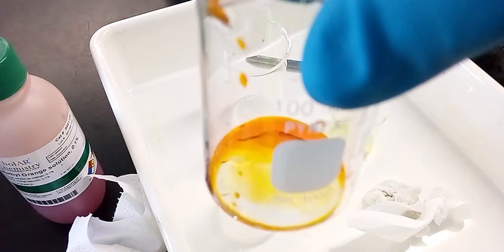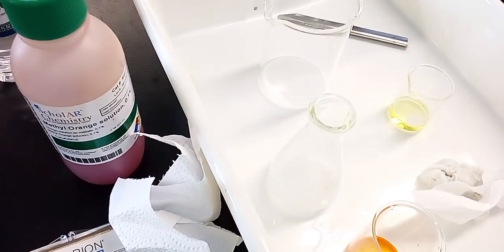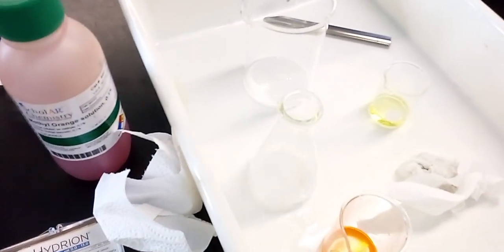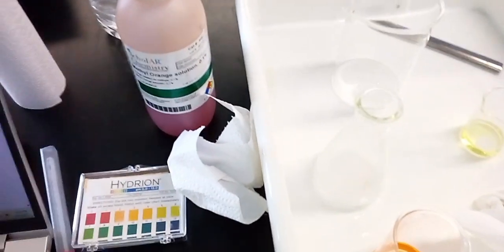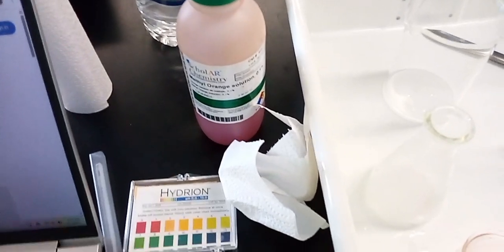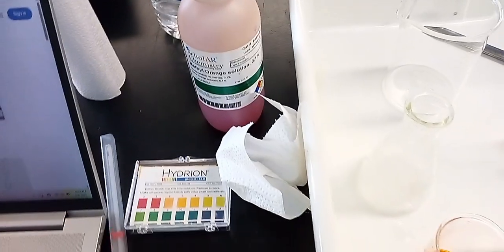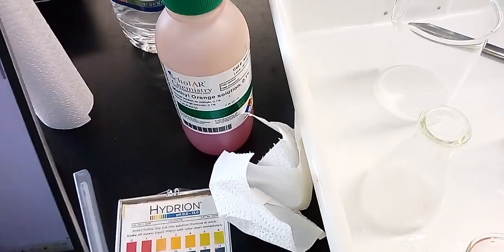It looks like this. Under basic solutions, it can turn yellow. If it's in a basic solution, it will turn yellow. If it's an acidic solution, it's going to turn red. And I have some in a test tube. I will show you in a minute how it looks.